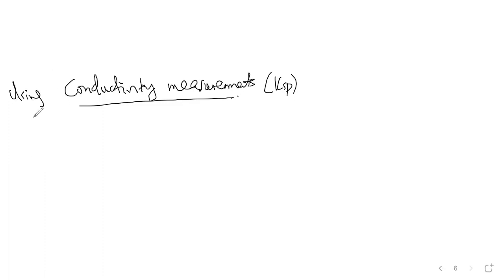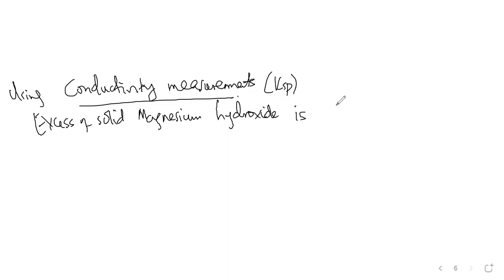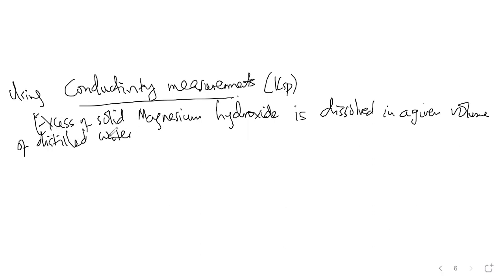We shall still say an excess of solid magnesium hydroxide is dissolved in a given volume of distilled water in a container.